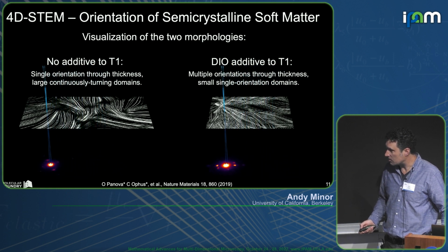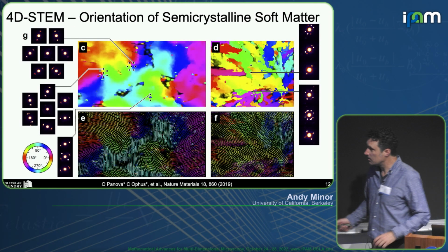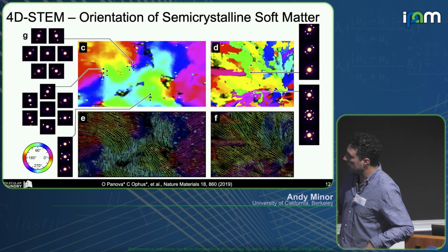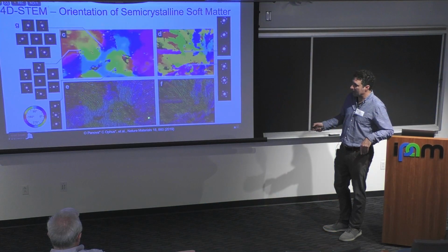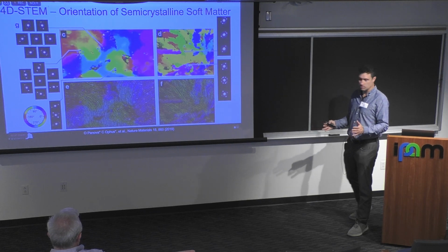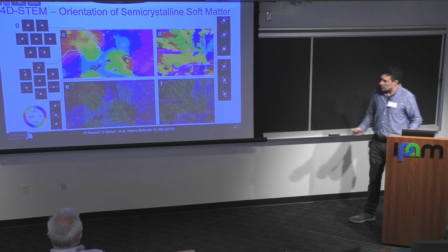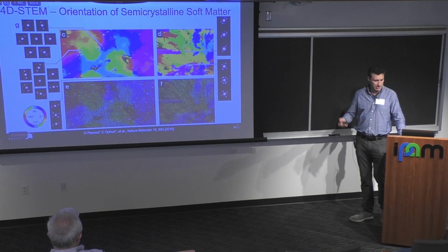The first type of visualization that we did with this is something that Colin came up with, which is this flow line analysis, where it takes this grain structure here, but it also takes the idea that we know these are molecules that are tied together. So it's not just the orientation of the grain, it's the fact that these are backbones of molecules that are tied together. And that allows us to essentially draw these lines that map the molecular arrangement of these small crystals.